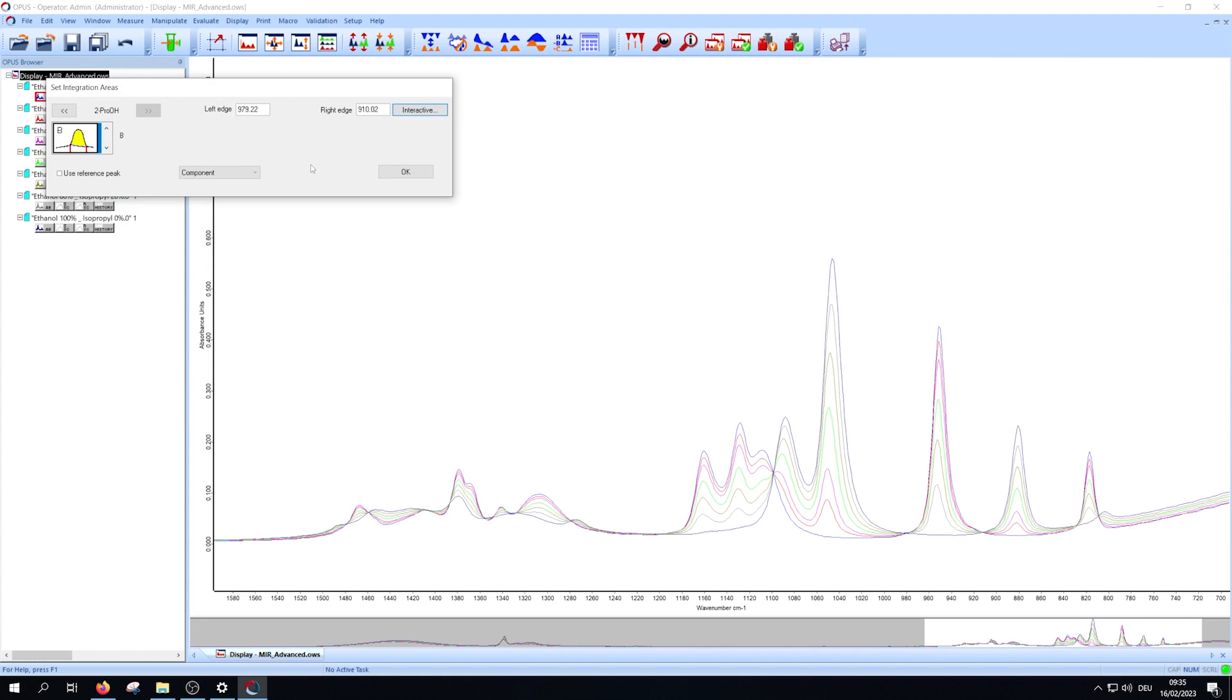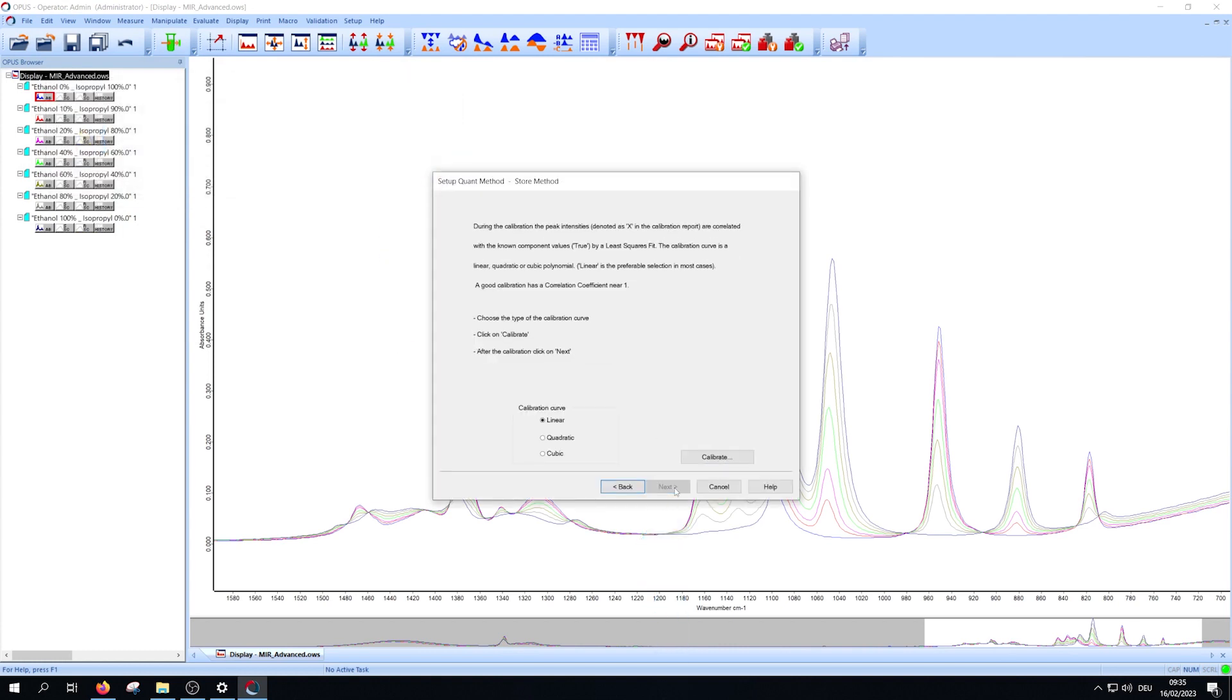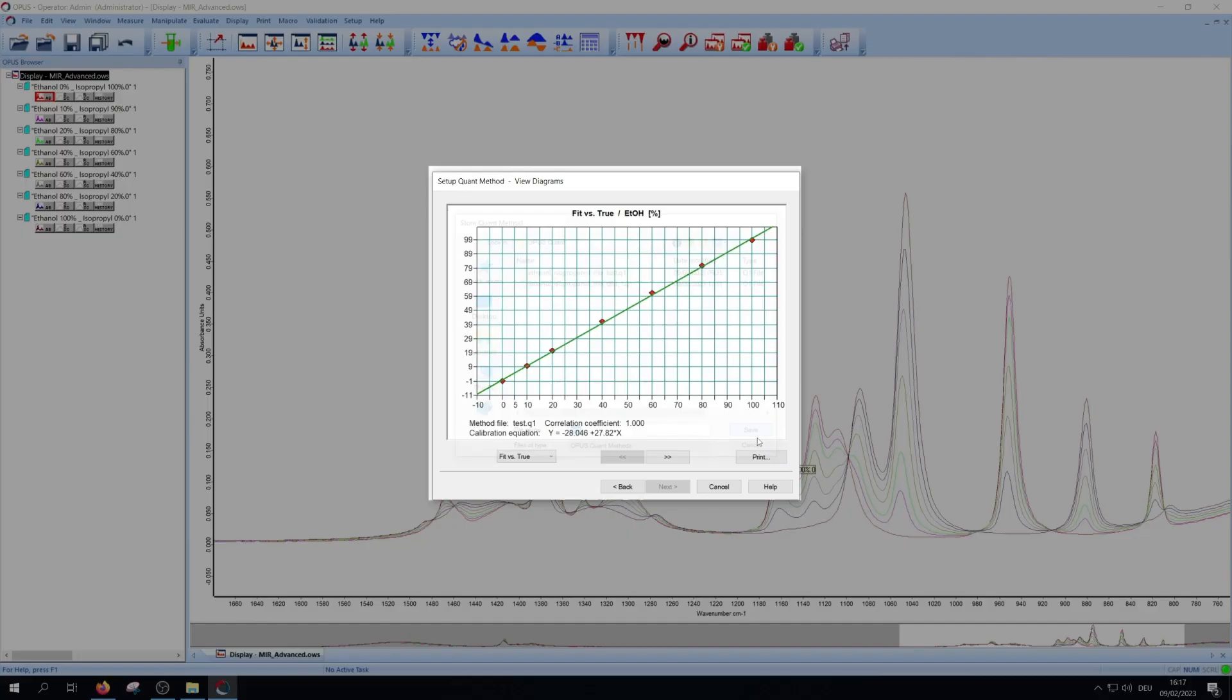Then press next. Afterwards confirm your entries with OK and press next. In the following step you choose the correlation between the area beneath the spectra and the concentration of the component. Usually it's linear. Then press calibrate to proceed and to save your setup file.